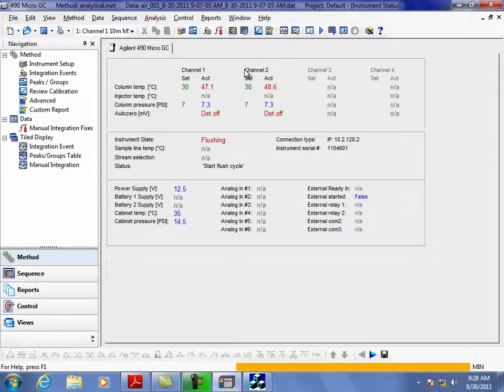What Bert was talking about is putting a T in line, maybe, and doing a syringe injection, and I think he got you part numbers for that. There's a caution when you do that. I can draw a picture, but you'd have a T coming in, and then a short capillary where you could put a septa on the end and inject into that.